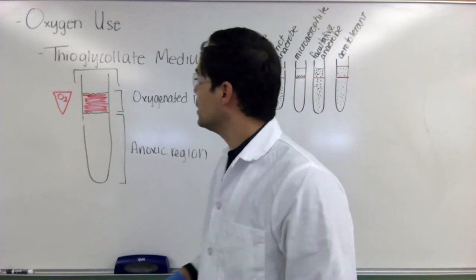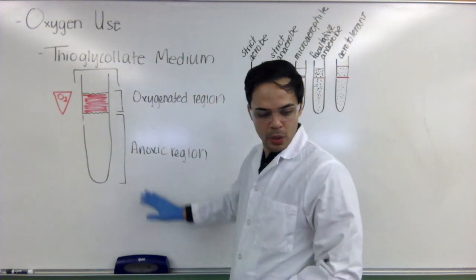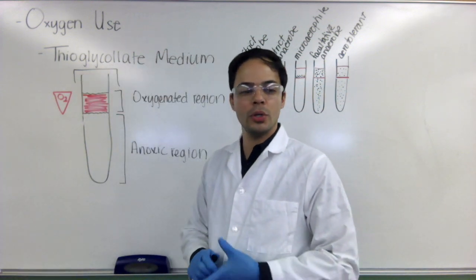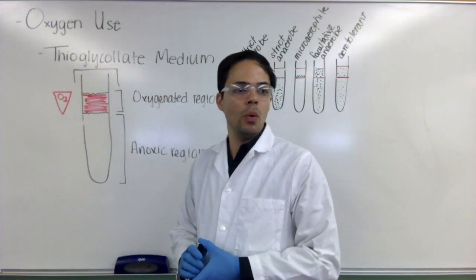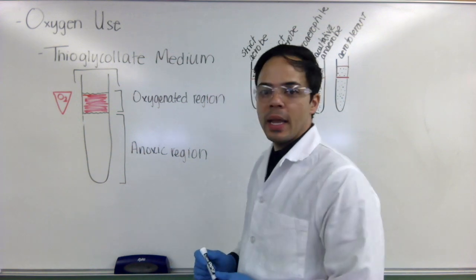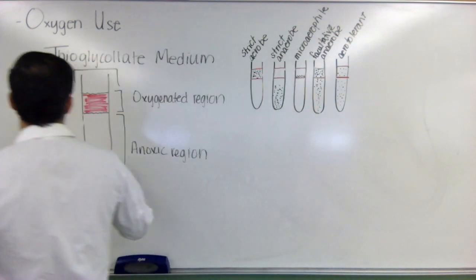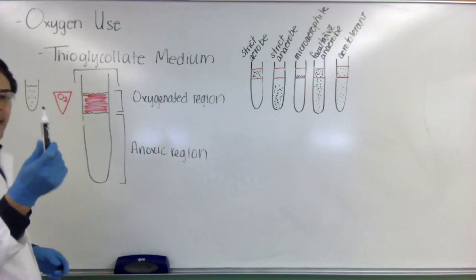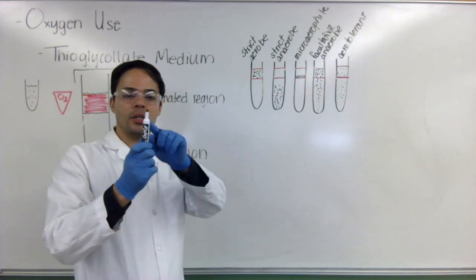Now how do we inoculate the thioglycolate medium? So what you want to do is you can start from a broth culture, you can start from a slant or you can start from a colony. Let's say we're starting from a broth culture. So what you would want to do is resuspend any pellet that might have been in your tube there and let's pretend that this is our inoculation loop.